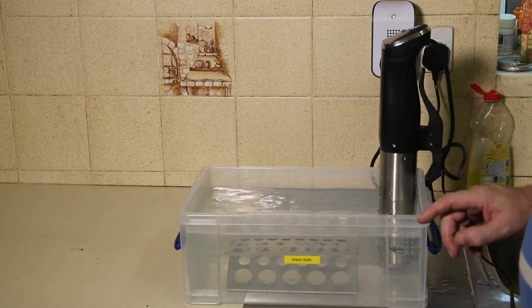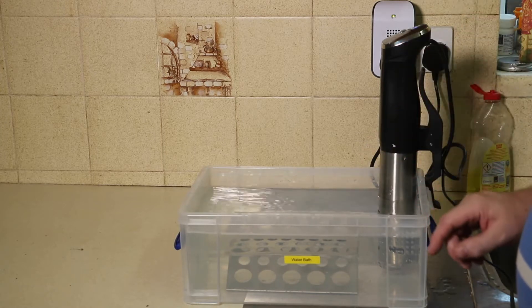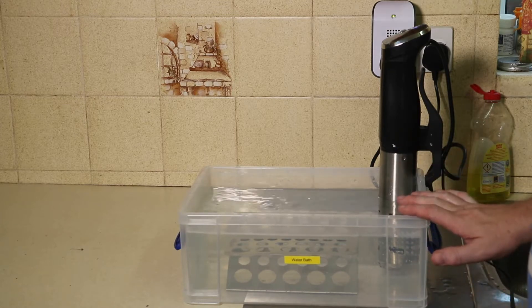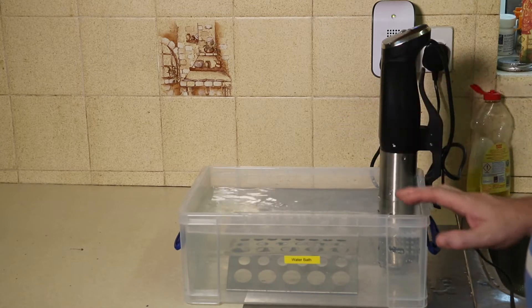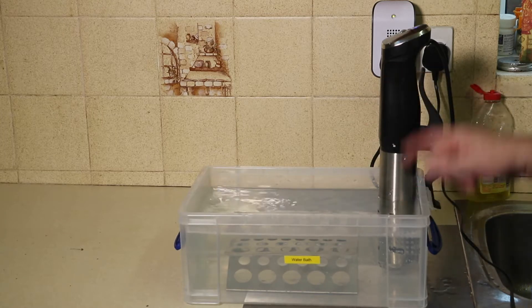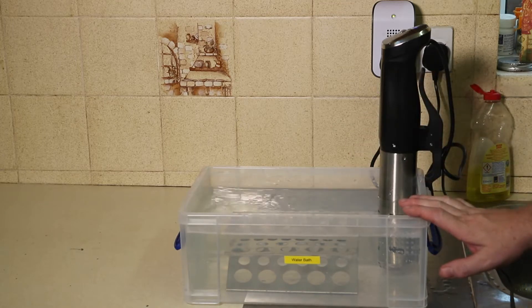The temperature has reached 40°C, which is the temperature of my water, and now the timer will start and keep this water bath at this temperature for 45 minutes — the length of my experiment. When it's done, all I need to do is switch this off, empty the water out, and this box is a good way of storing the sous vide and all the other bits and pieces I need to do any experiments.